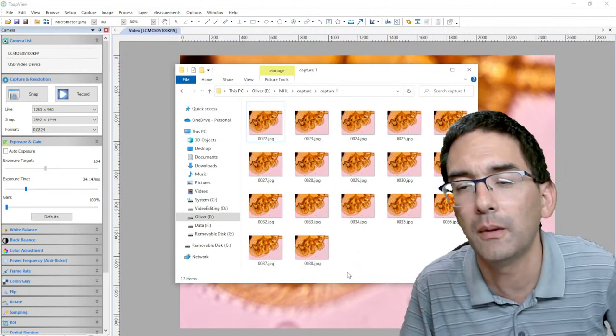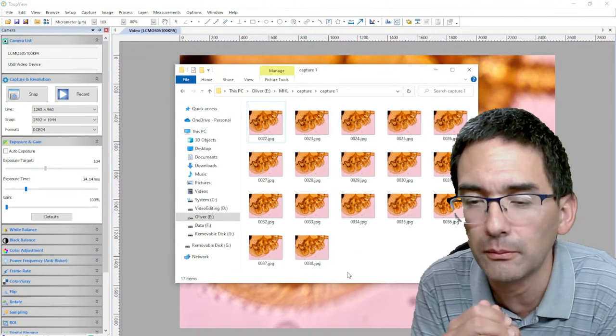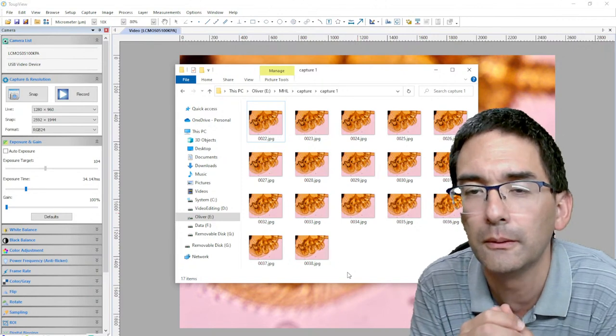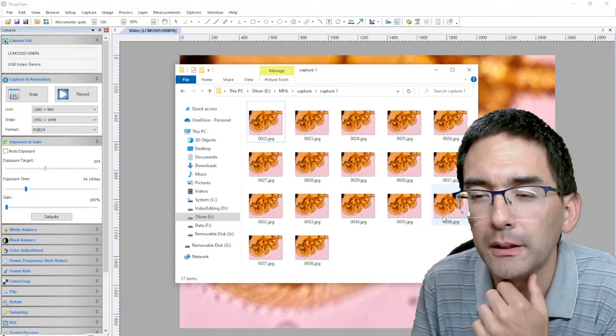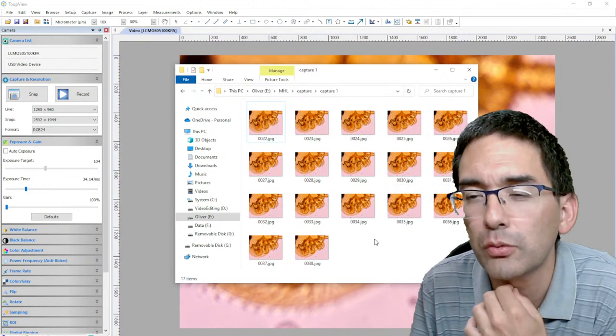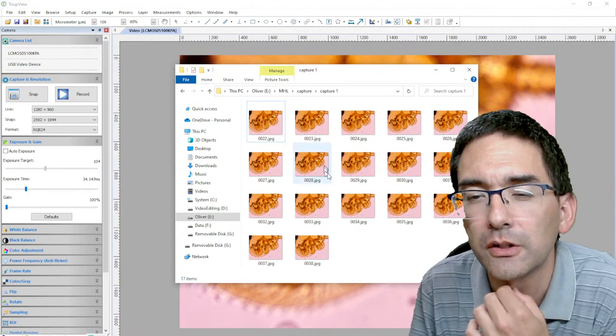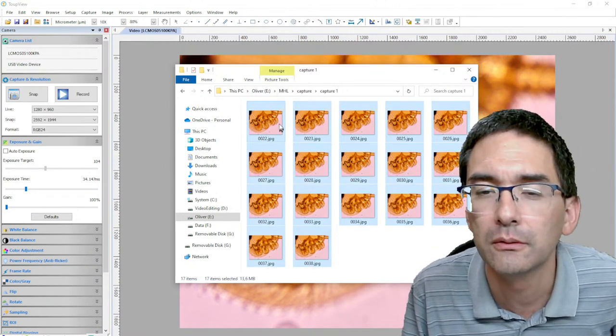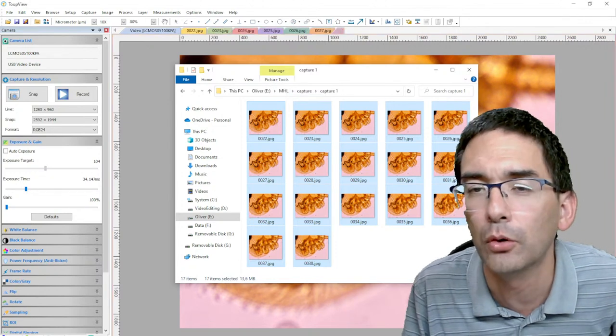Okay, I've got the pictures of different depth, with different focus. I've been doing this very sloppily right now. Okay, let's try it again. Let's try it. Who cares? Let's try to stack those. Let's give it simply a try. I import them over again.